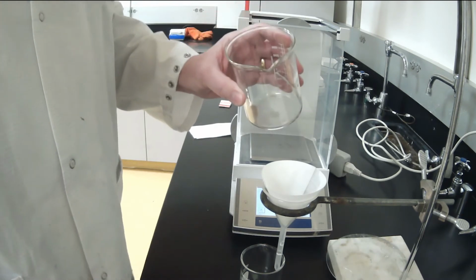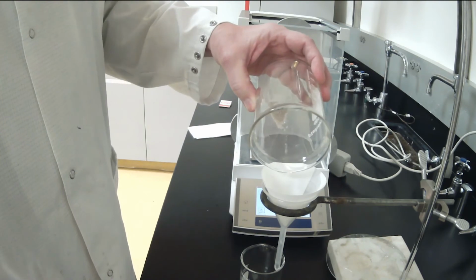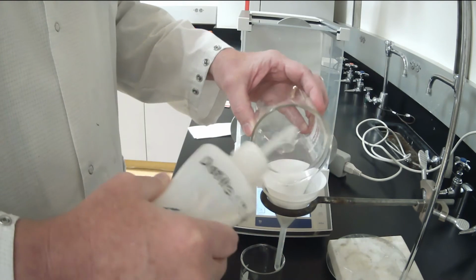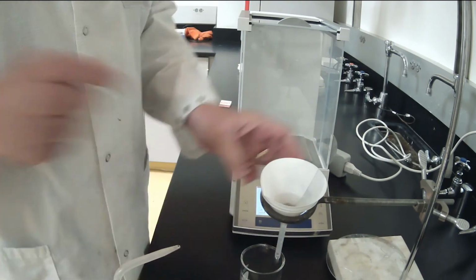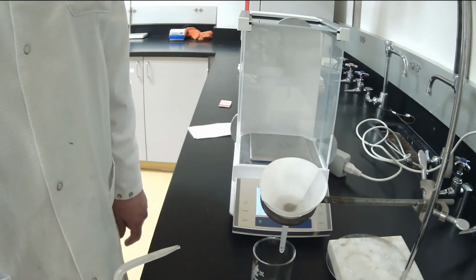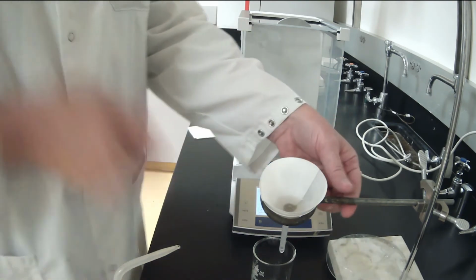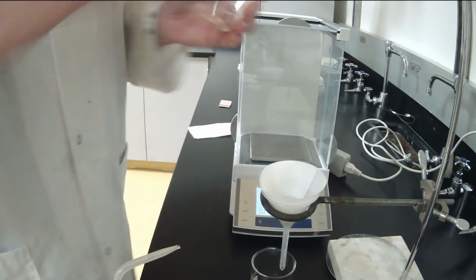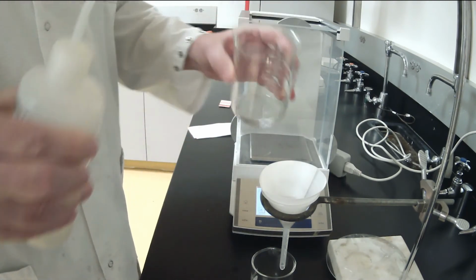There's a couple ways you can do this. One of the easiest ways is to just pour all of the sand and salt in dry. Then use your squirt bottle and rinse out the sides multiple times. So you see the sand has collected there at the bottom of the filter paper, and we have water in there. Now I'm going to reset this straight up. You're not going to be able to see down inside for a moment. But we want to make sure we have everything out of the first beaker. So I'm going to do one more rinsing of the first beaker.